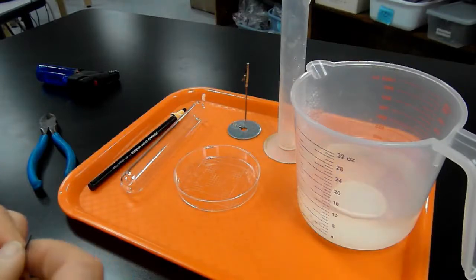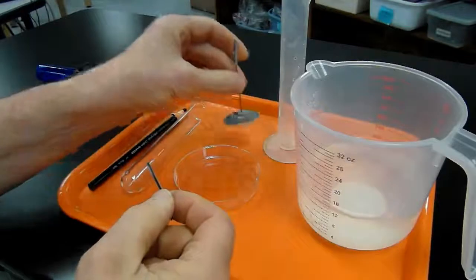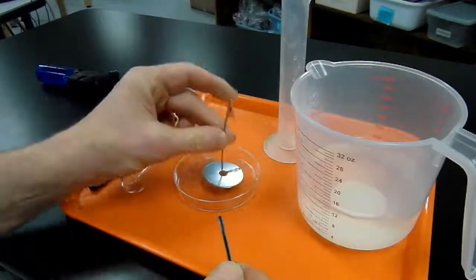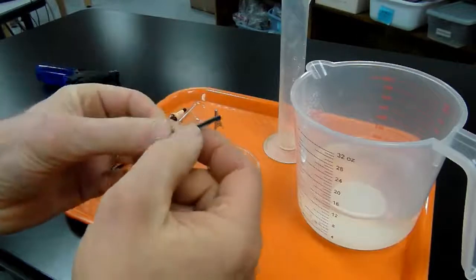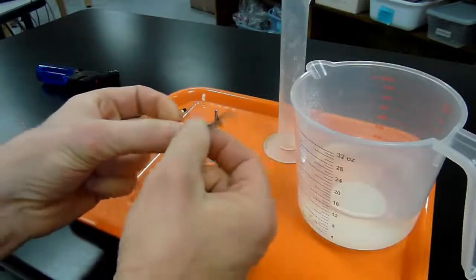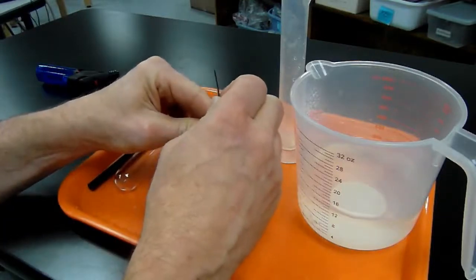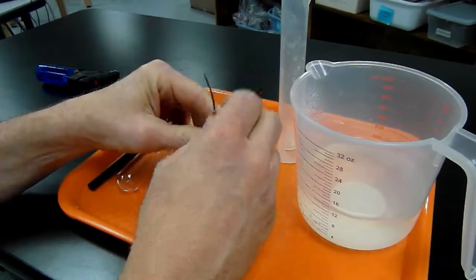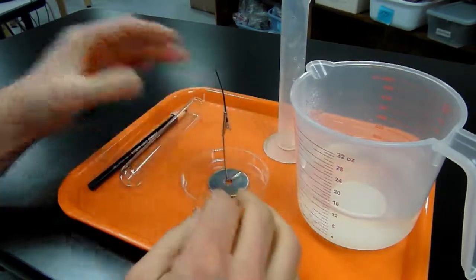So let's do our partial pressure of oxygen experiment. We're going to make a little magnesium candle. I have these little clip stands that I made plus 5 centimeters of magnesium ribbon. We're using some older magnesium ribbon. It's got some black oxidation on it, I'm not sure of what kind, but that shouldn't bother us. We just need something that's going to burn and consume oxygen and turn it into magnesium oxide.